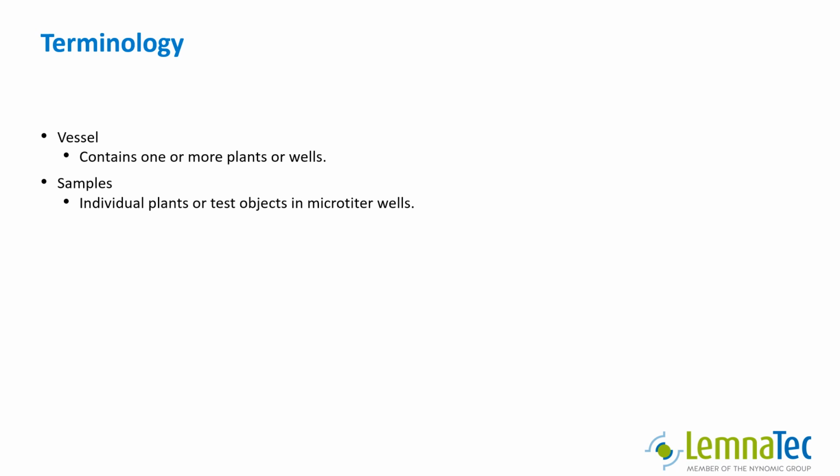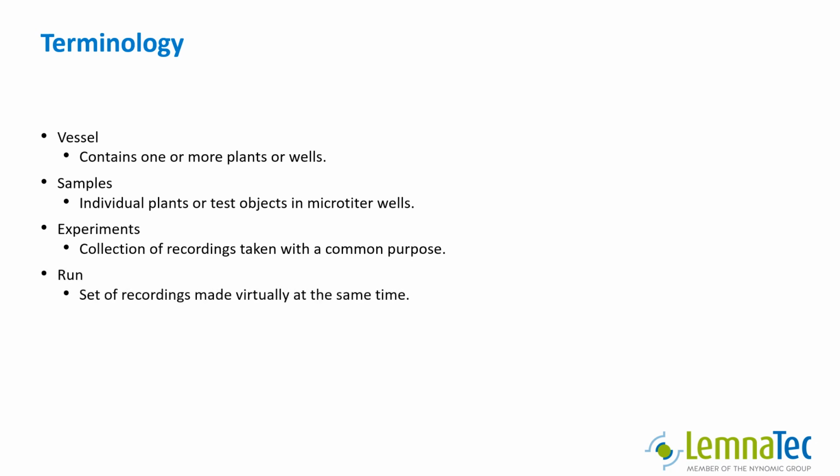In order to manage the data in the system, we organize the recordings and other data into experiments. Each experiment is a collection of all recordings, analysis results, and other data taken with a common purpose. With most experiments, you will record the same data multiple times at different points in time. We call it one run each time you take another set of recordings for your experiment.